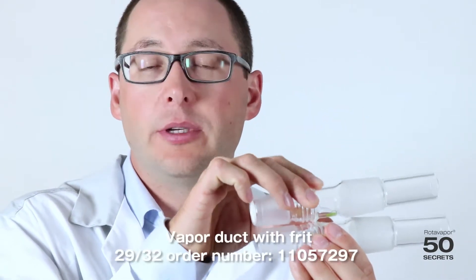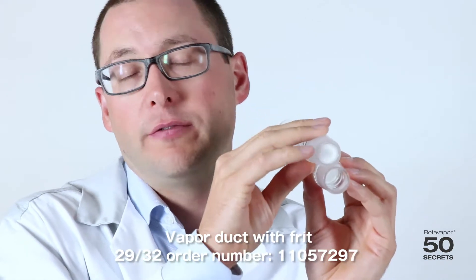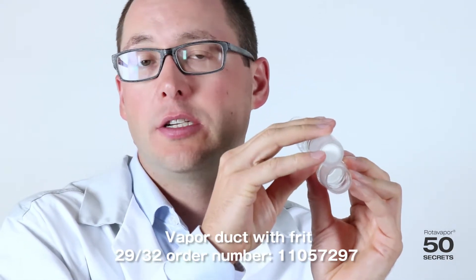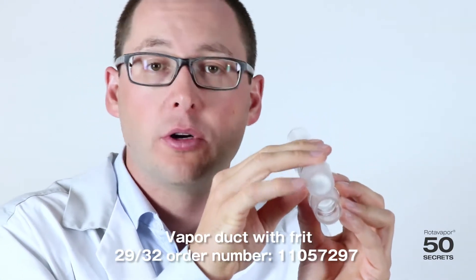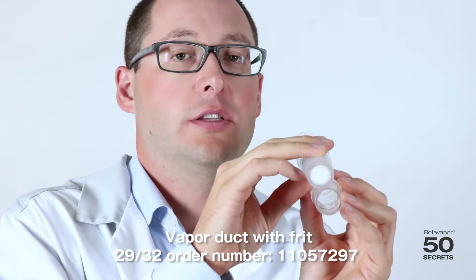The second vapour duct looks very similar — it has the same length and same diameter. But when you look into the front of the vapour duct, you can see there is a frit. The frit is used to prevent powders from going from the evaporation flask into the condenser. That's the frit vapour duct.